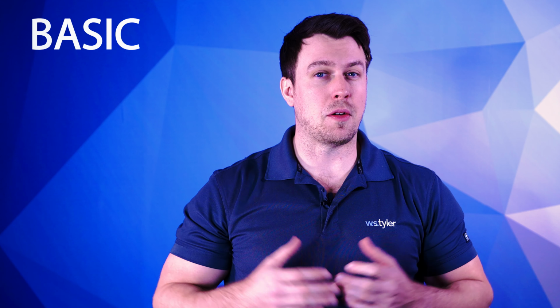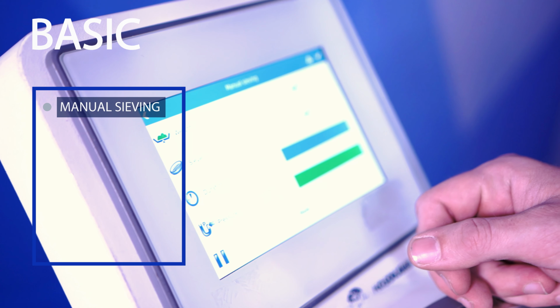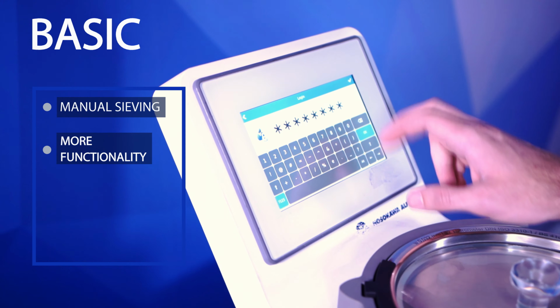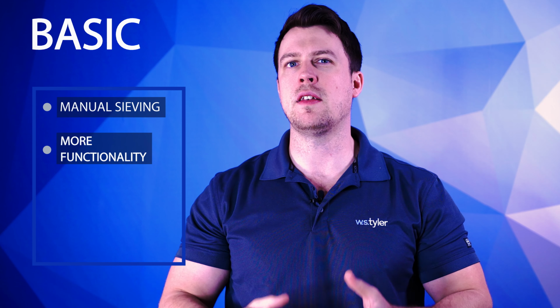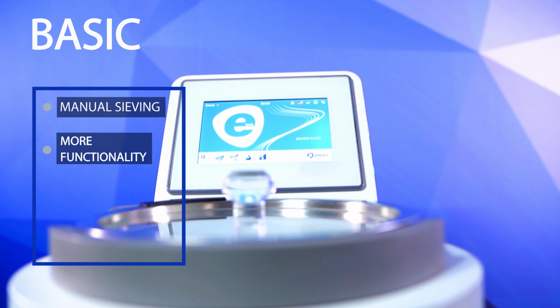The Basic is going to allow manual sieving, which allows you to go in with your username and run a test based on parameters you select in the menu. You're going to get a little bit more functionality, so for example, you will have user logins. You'll be able to create SOPs, which are essentially parameters for the tests that you want to run, based on what material you're running. You can enter the pressure because it's internally regulated at this point, there's no valve.